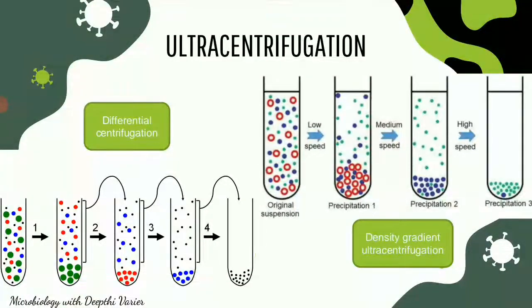It is a specialized technique which is used to spin the samples at very high speed. Just like our normal centrifugation, here also the principle is that the components in a solution are going to be separated based on their size and their density, and even based on the viscosity of the medium or the density of the medium or the solvent.